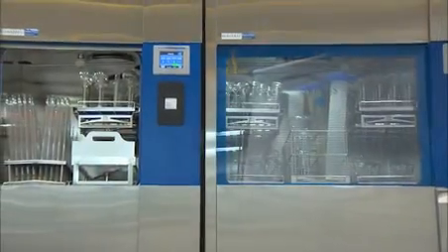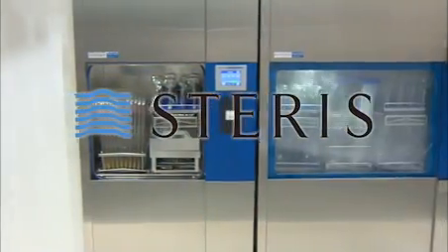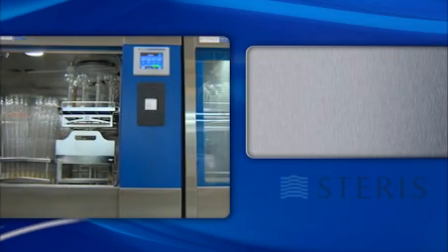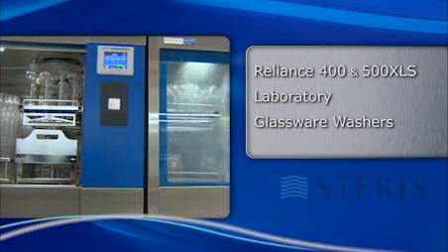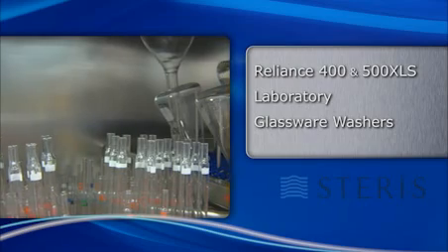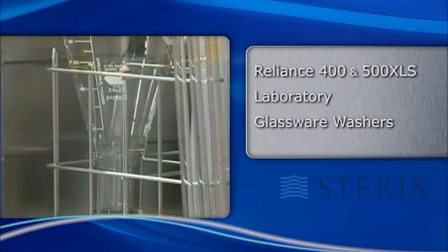Introducing new advanced high-performance laboratory glassware cleaning systems from Steris Corporation. The Reliance 400 and 500 XLS washers are designed to efficiently clean and dry typical laboratory glassware and plasticware used in research facilities.